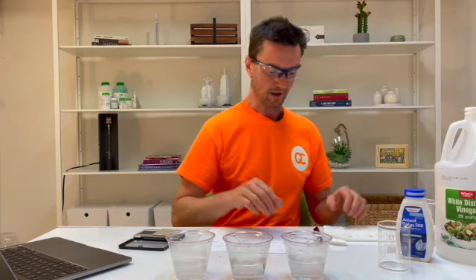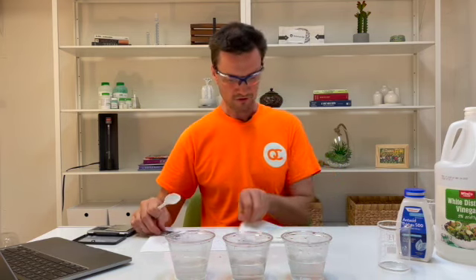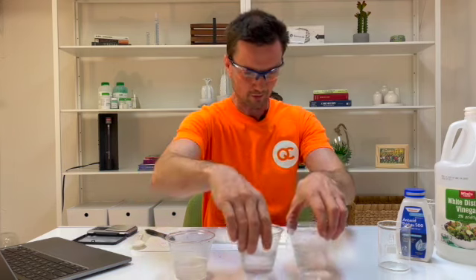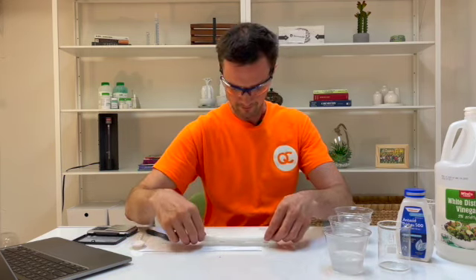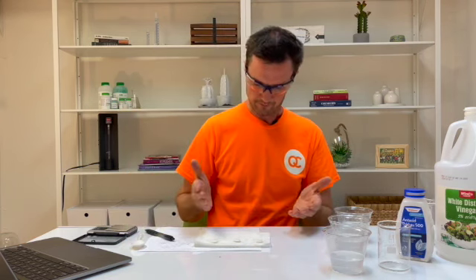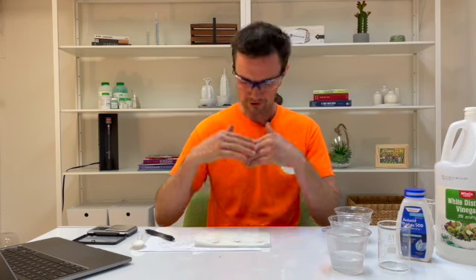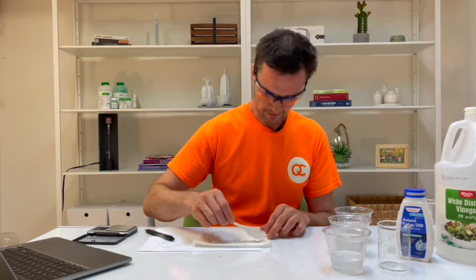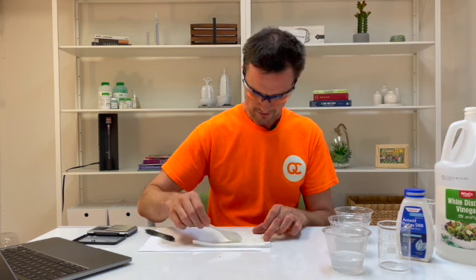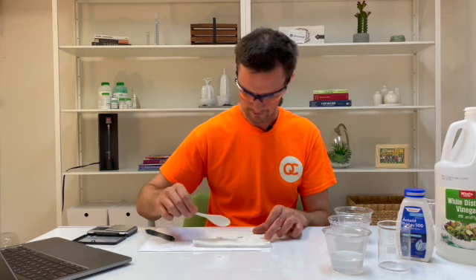And then on this paper towel I have on my desk, I can move these out of the way so you can see better. You'll be able to see on yours that the water from the Tums is soaking into the paper towel. Maybe gently flip over the Tum once or twice so it looks dry on the outside because we don't want to weigh the water.